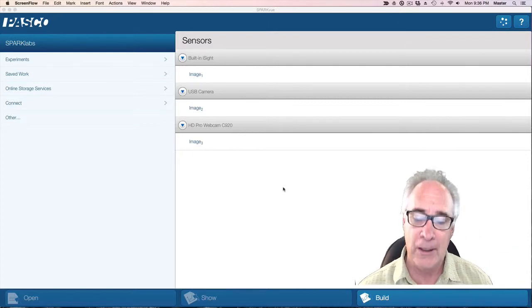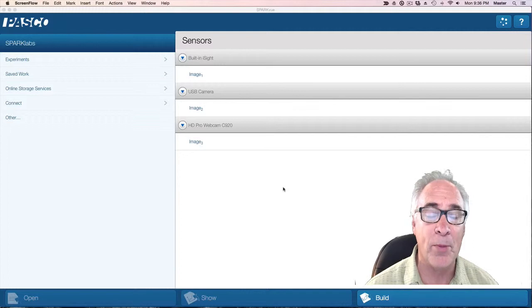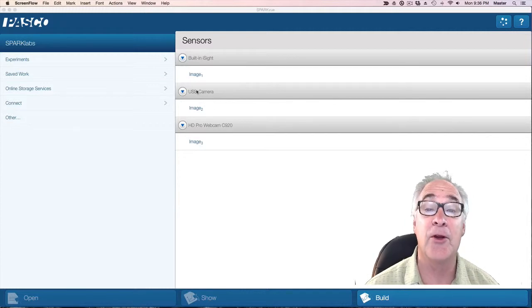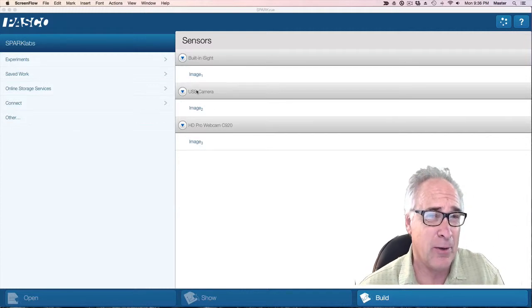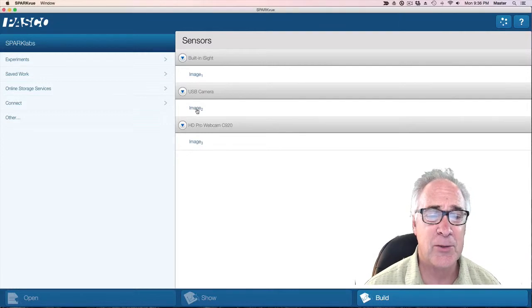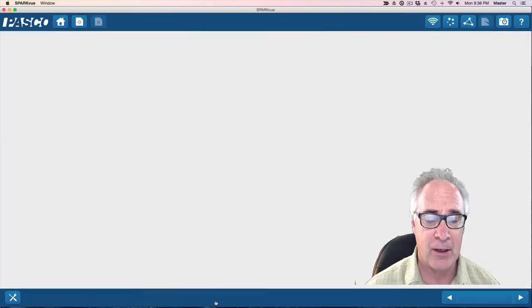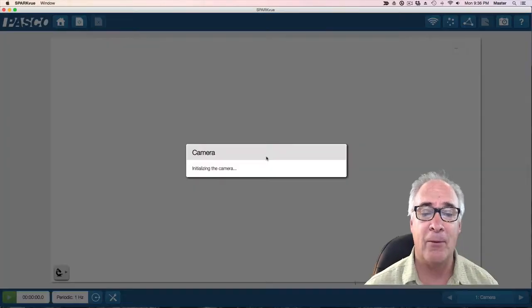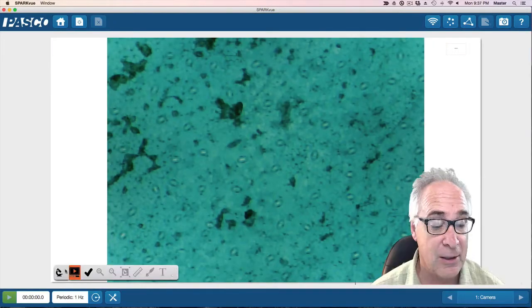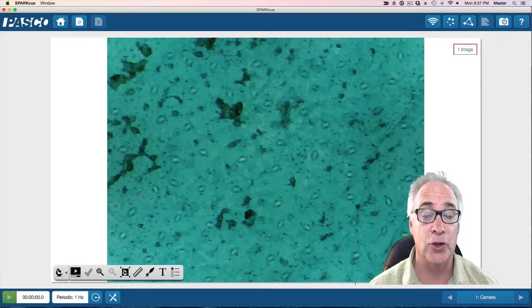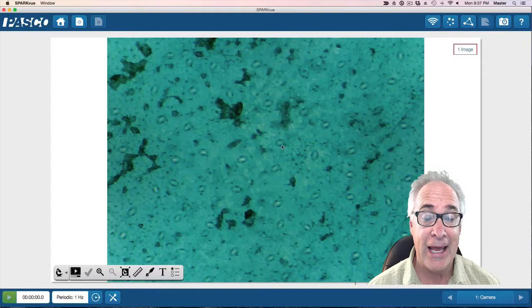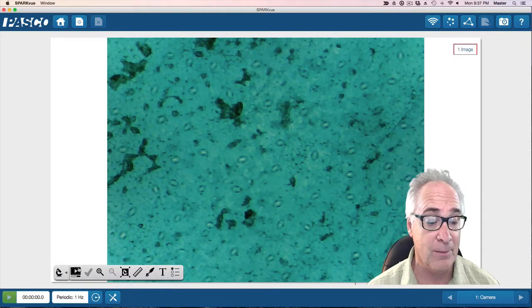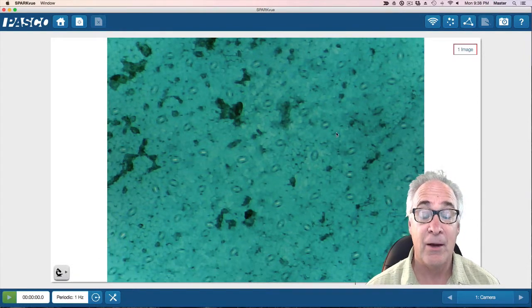I've got PASCO Spark View open. At this particular point I'm looking for the USB camera, because that's really all the microscope is. I'm going to click Image, then Show, and then I want the camera to play its image. Now I'm going to click on that and it should save that image.